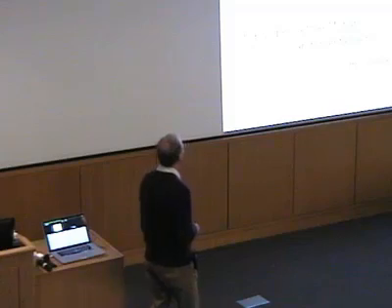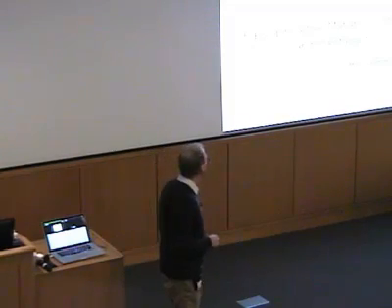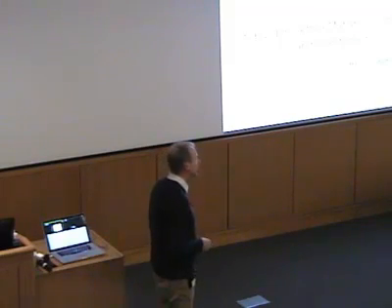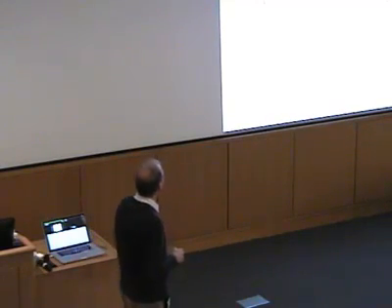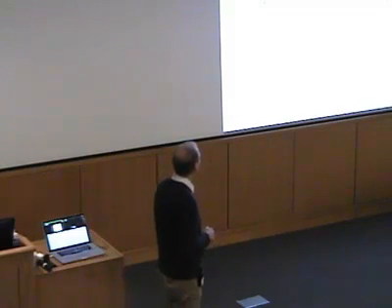All right, so this is a small molecule in solution. We get a spectrum like this, and we can simulate the spectrum, get out the hyperfine couplings if we're lucky. Once we've got those couplings, we'd like to interpret them in some way. The main term for the hyperfine coupling is the so-called Fermi contact term.